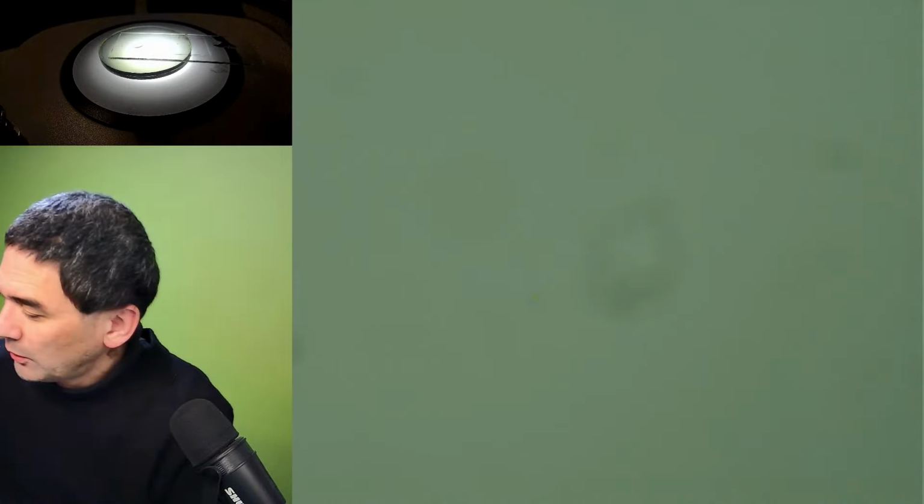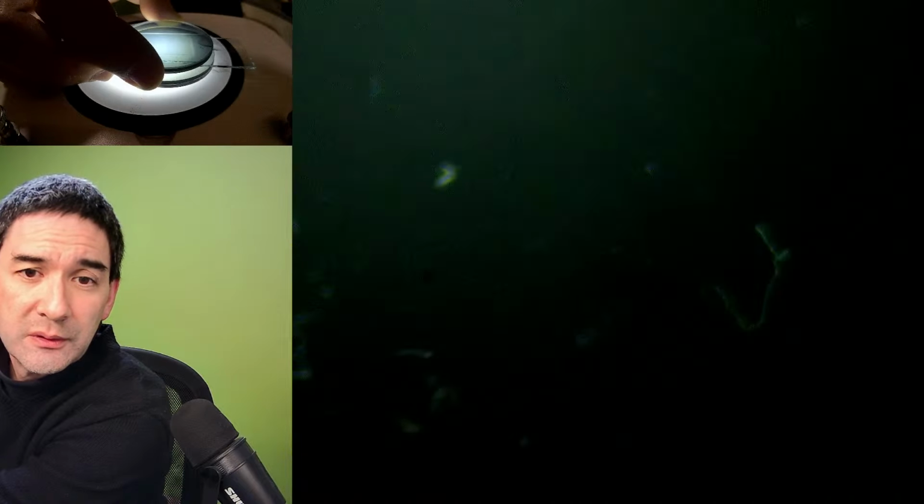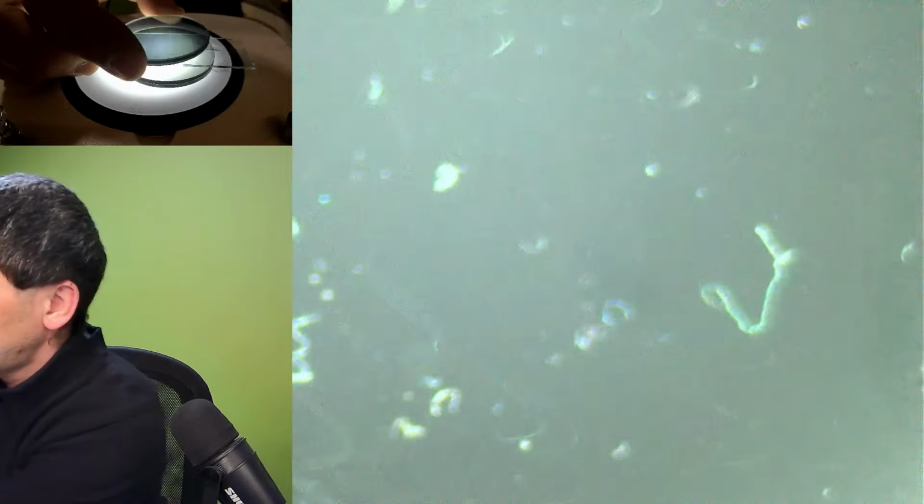You see that I have a problem now. How am I going to hold this over that here? And I have to somehow refocus this. Let me zoom out. Okay, here we go a little bit.